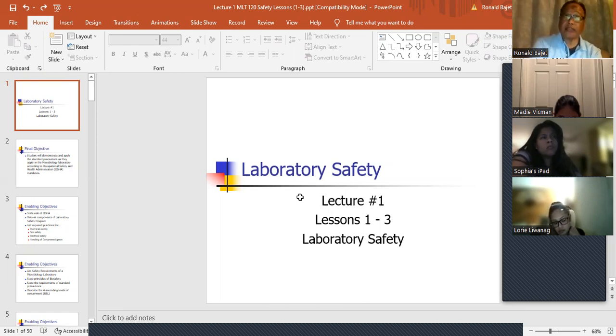So one of the things that I want to do this semester with you guys, as opposed to what I've been doing with other classes, is teach you how to read cultures. Because when you work in a microbiology laboratory, you will be assigned to different benches. You can be assigned to the respiratory bench, the urine bench, the miscellaneous or wounds bench, or the blood culture bench. And one thing I like about microbiology is if you're assigned benches like that, you can read cultures.